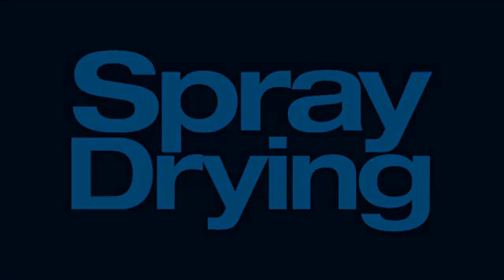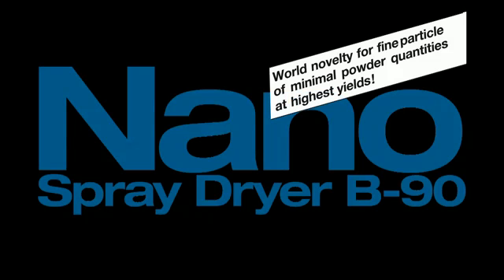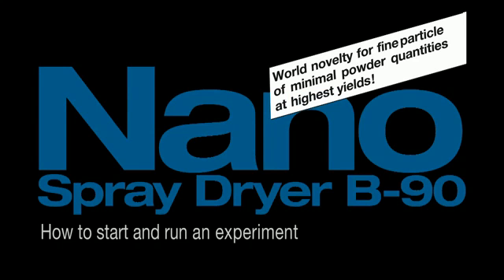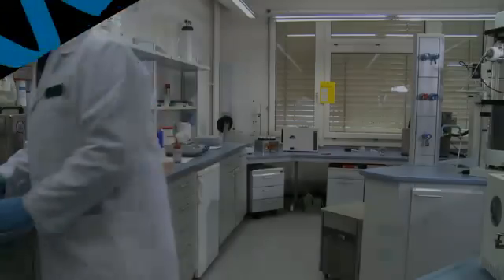The nanospray dryer B90, a world novelty for fine particles of minimal powder quantities at high yields. How to start and run an experiment.